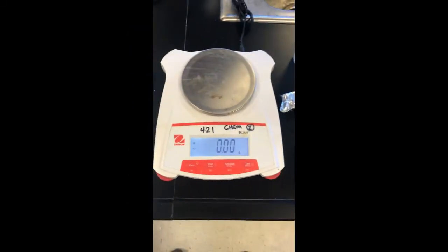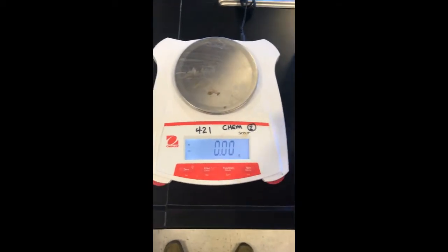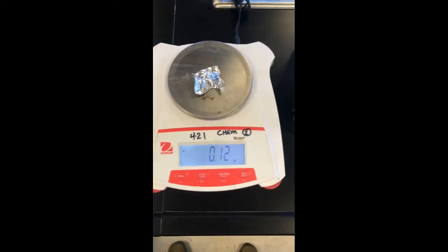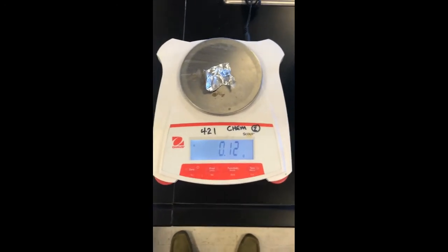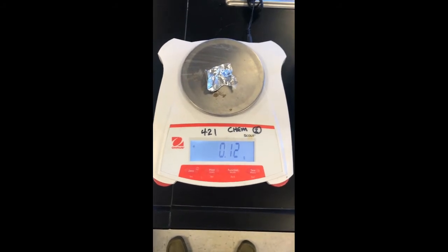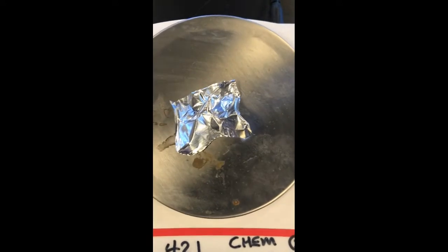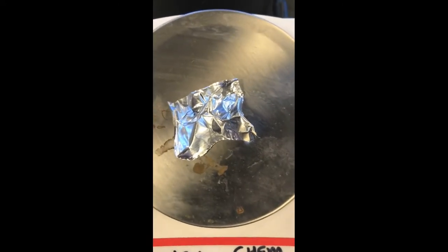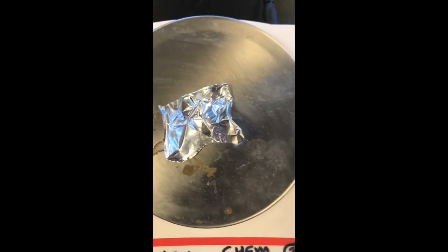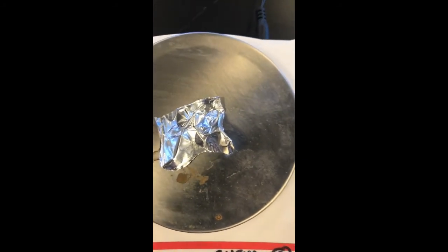All right, as we begin, our directions tell us to mass out 0.1 grams. For your calculations, you will be using 0.12 grams of aluminum foil. Notice initial observations: shiny, glimmering, luster, solid, silvery.